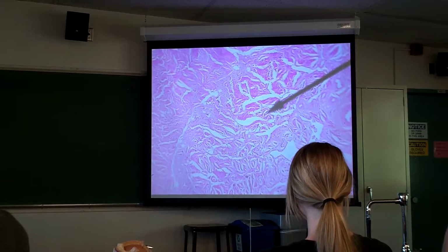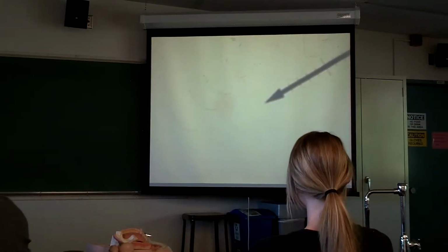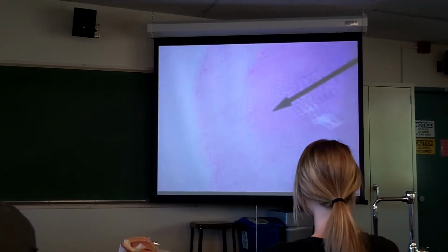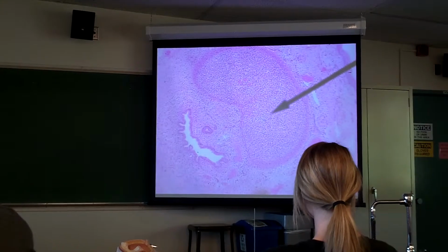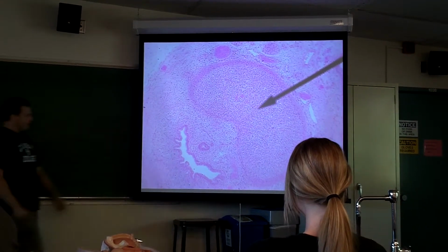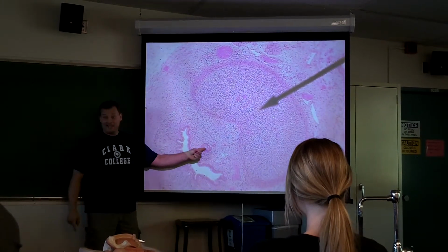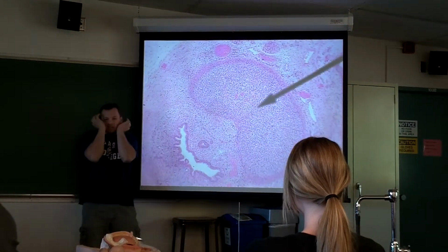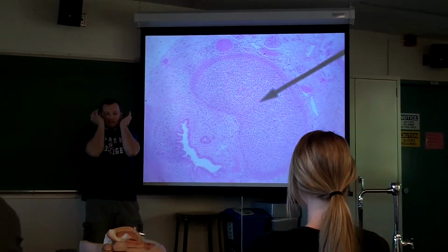Now, I'll end with this. We only have one of these slides. It's kind of sad because it says penis, human fetus. But you'll only be sad for a moment. Because once you actually put the slide on, you'll realize that this penis face is smiling back at you. So the urethra happens to be curved into a smile here. There's a little gland right where a nose would be. And it's like this person is wearing those nightshades, or maybe a cool pair of sunglasses.